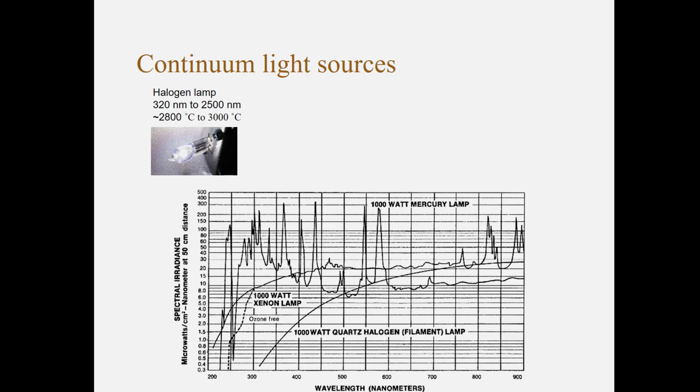To stop it doing that, you put it inside a glass container where you can have an atmosphere which doesn't contain any oxygen. And then you can keep on heating up your wire to hotter and hotter temperatures, but there's no material which can get to the temperature you had in a xenon light, which was in this plasma.